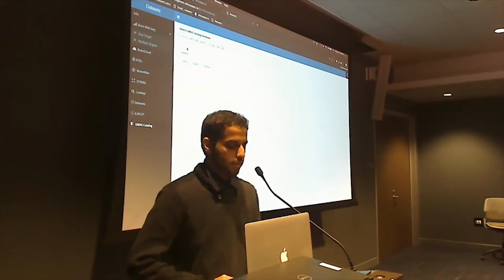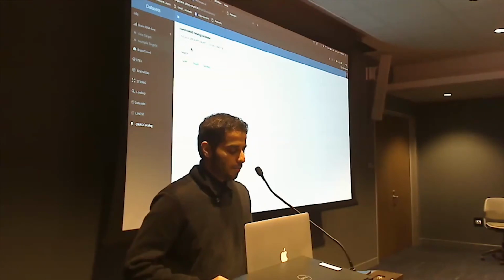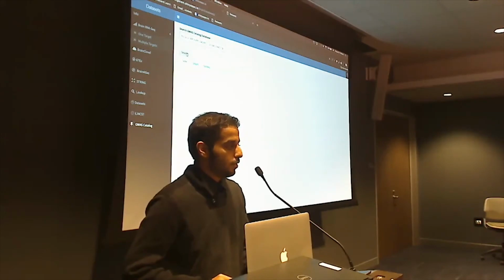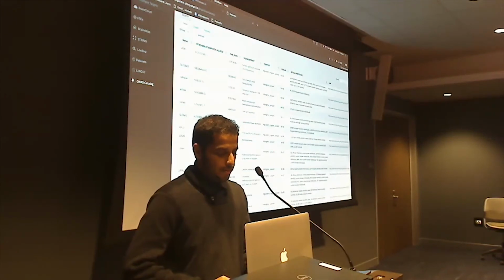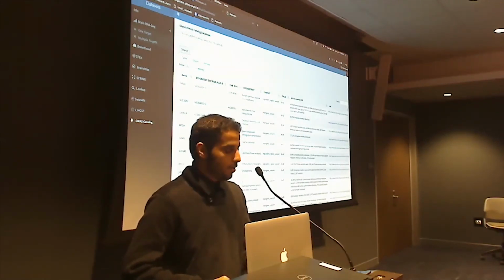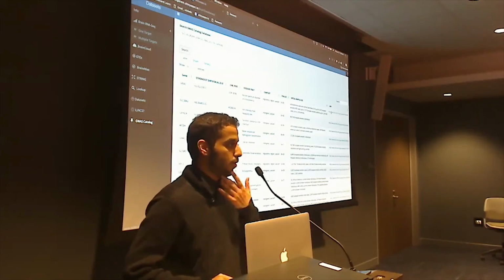So we also have this GWAS catalog database. Like I said, this gives you genetic variants and phenotype association. This is a huge database with over 4,000 studies and about 200,000 SNPs and phenotype associations. So it gives you what kind of SNPs. We have these target genes and the SNPs and the context of the SNP and the p-value, and also a link to the actual study where you can go and read about the study.